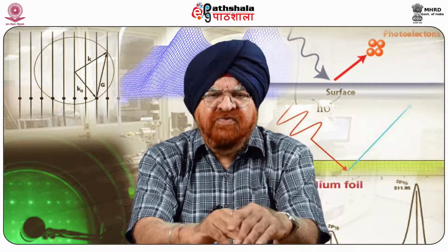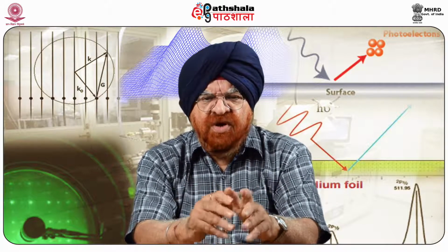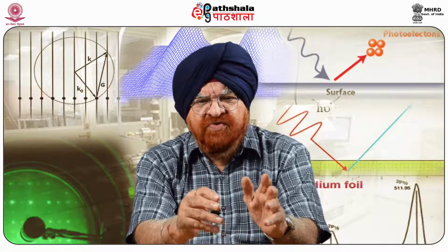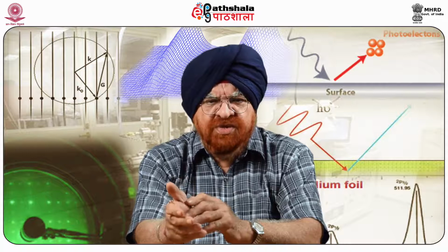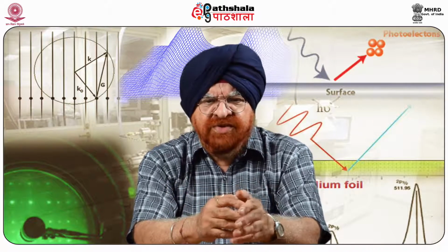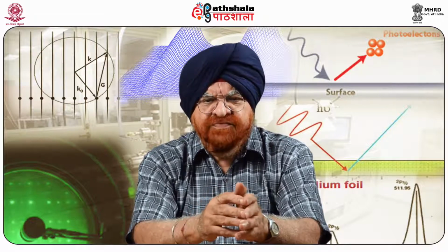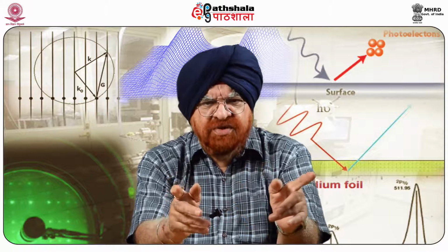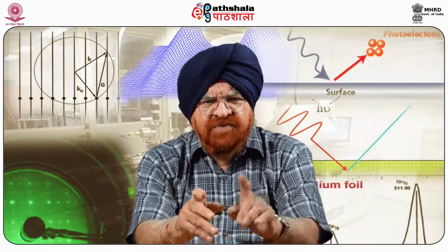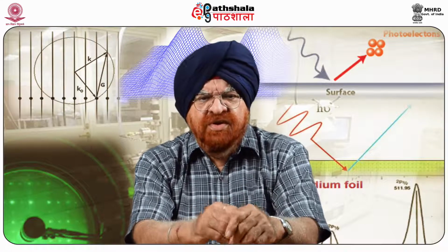Chemically distinct information about the membrane surfaces was deduced based on differences in adhesion between the CFM probes and the membrane surfaces, using both traditional atomic force microscopy, that is AFM force measurements, and spatially resolved frictional images.